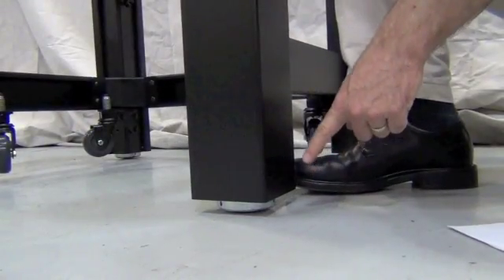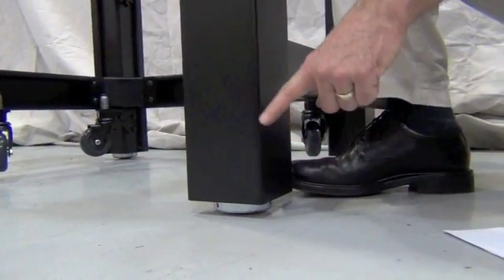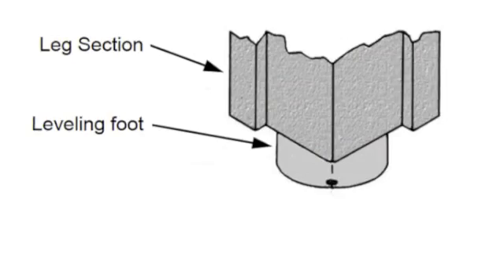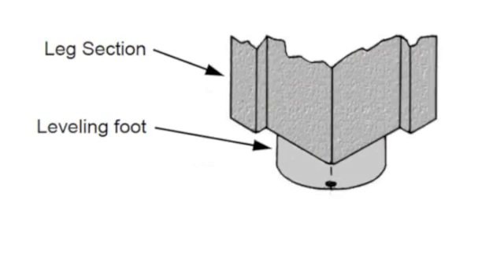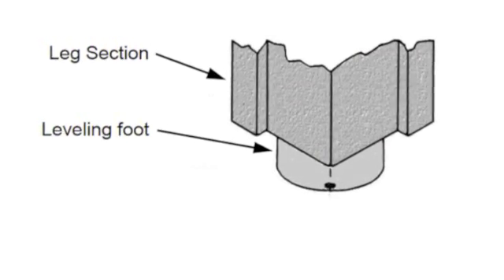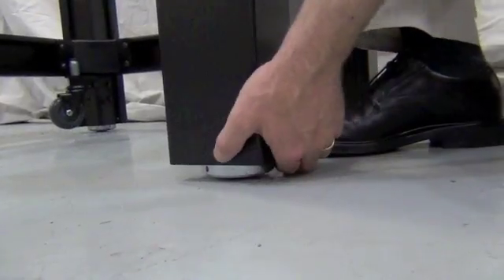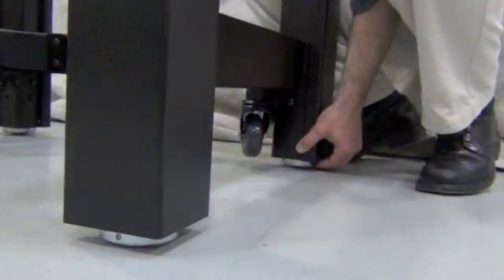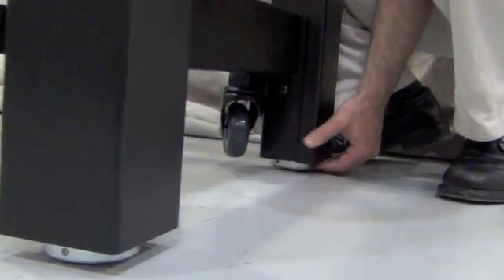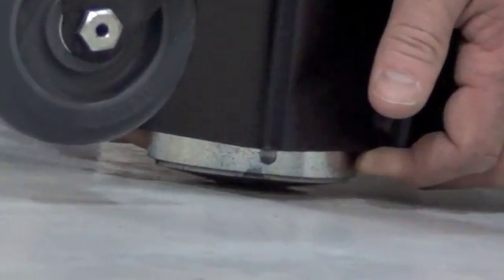Once the table is positioned, adjust each leveling foot on the bottom of the leg so that the dimple is pointing towards the front or side. This will make it easier later when leveling the system. Do not extend the leveling foot too far out. It is difficult to get back on. The leveling foot has a 5 eighths inch throw and is shipped in the middle of the throw. Be careful not to pinch your finger under the leveling foot.